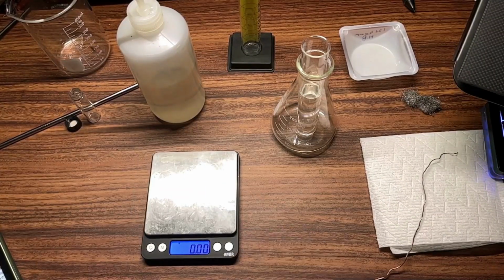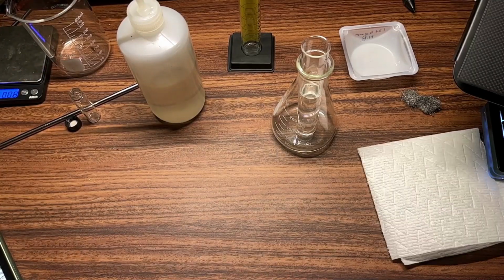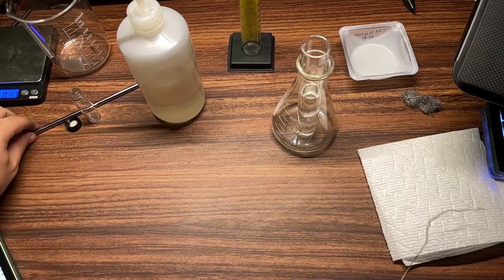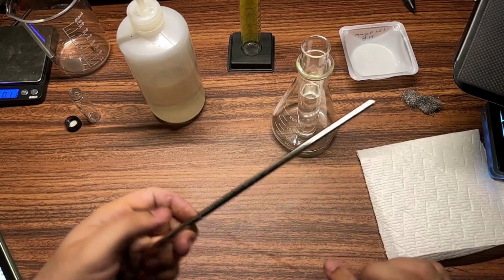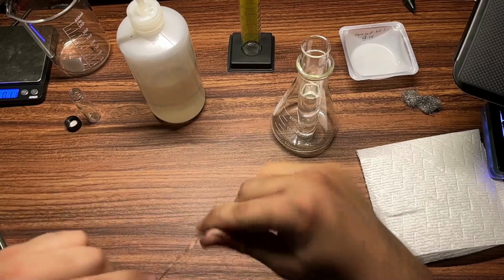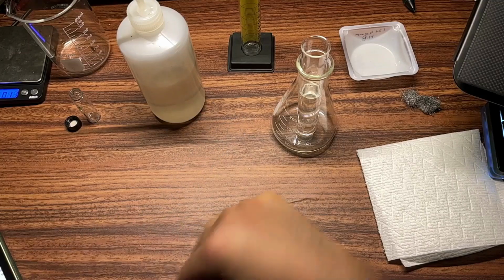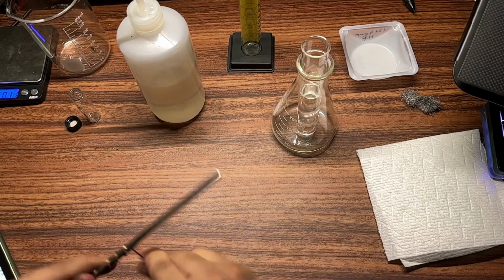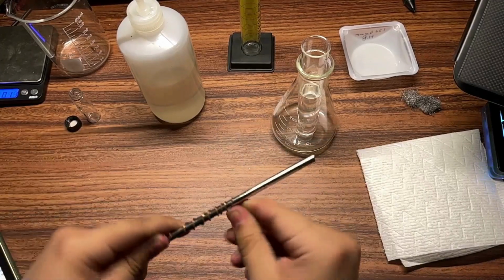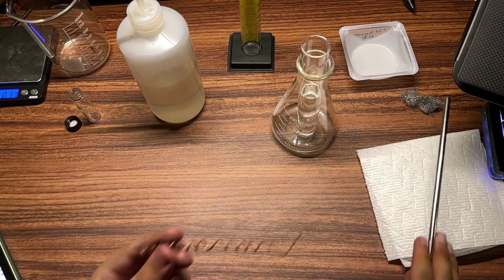Great. I can put the balance away for now. And I can prepare my copper. So remember, we just want to coil this around something thin and long. I'm using this metal straw that I have. Get a nice tight coil to make a spring of copper. And just slide that out like that, and here's my spring.